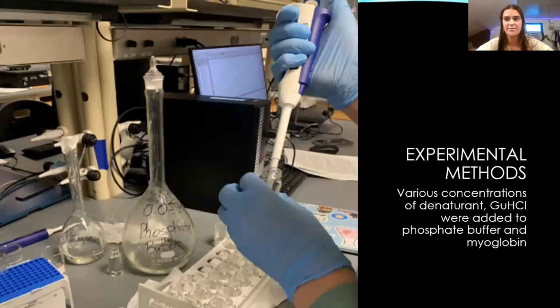In order to investigate protein unfolding of myoglobin, various concentrations of guanidine hydrochloride were added to phosphate buffer and myoglobin. Fisher brand Elite micropipettes were used to transfer stock solution to disposable centrifuge vials to make 19 sample solutions. This can be seen in the picture shown.